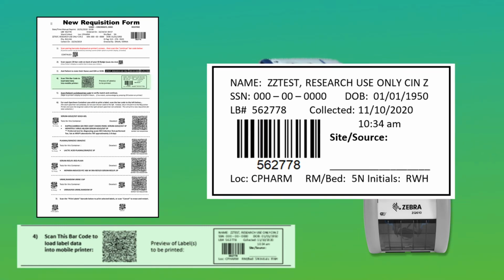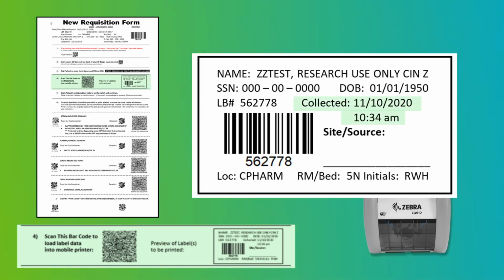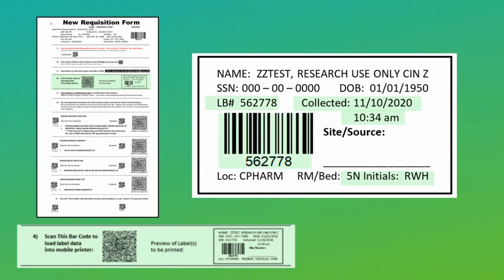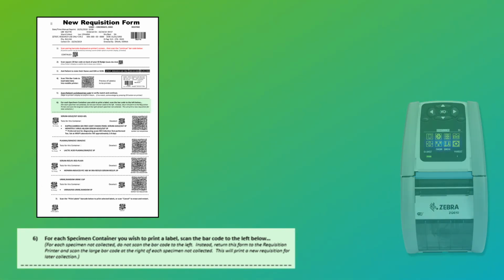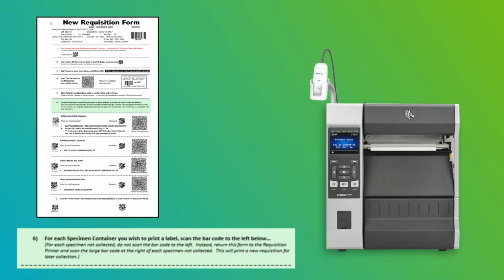There is no longer any need for handwritten information, such as the date and time collected, and the clinician initials. The lab rec number is also included in both barcode and human-readable formats for lab processing. There is also some space reserved to handwrite site or source info if desired. If any specimens were not collected, those that remain can be recycled and reprinted for later collection. This is done by scanning the large 2D barcode on the right side of the form using the scanner attached to the Zebra tabletop printer.